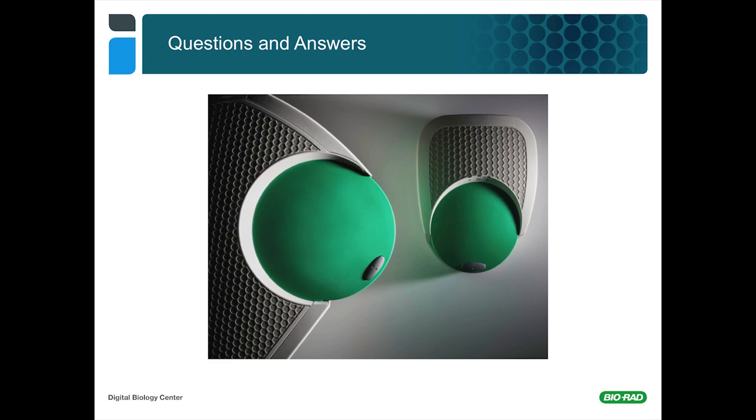As I mentioned for the EvaGreen, a larger amplicon gives you a higher fluorescence. Interestingly, it's the inverse of that for TaqMan probes. So with both systems, we've managed to multiplex by a combination of the two dye channels combined with amplitude variation to position clusters in ways that you can distinguish as many as 4 targets in a single sample well.